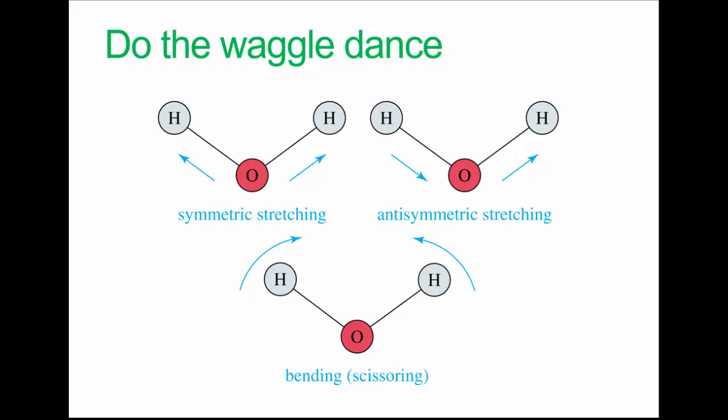When infrared radiation interacts with molecules, it produces a range of molecular motions, including stretches and bends, and these are characteristic of the molecule absorbing the radiation and produce what's called a fingerprint. So we have symmetric stretching, anti-symmetric stretching, and bending and scissoring. You can try doing this as sort of mildly aerobic exercises if you want, just to help you memorize stuff.